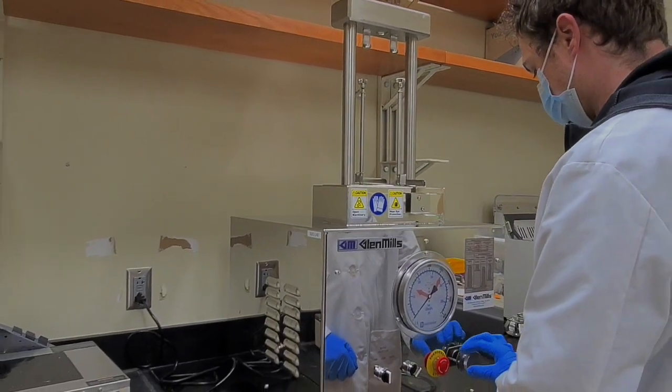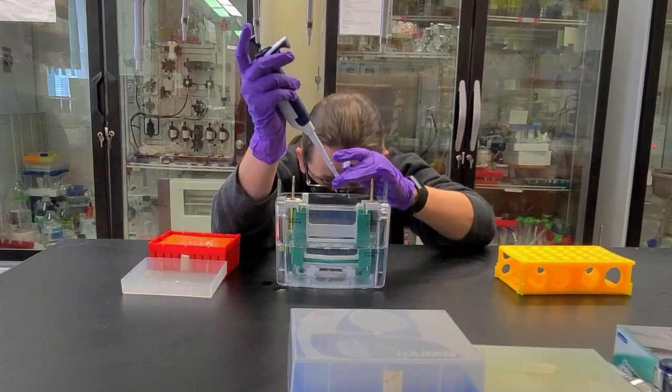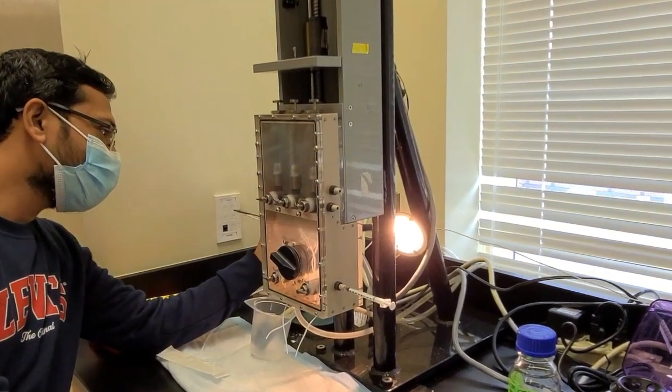Currently our lab utilizes a wide variety of molecular tools and equipment for research which include radiolabeling and rapid chemical quench flow for kinetic assays, which allow us to monitor reactions millisecond by millisecond.